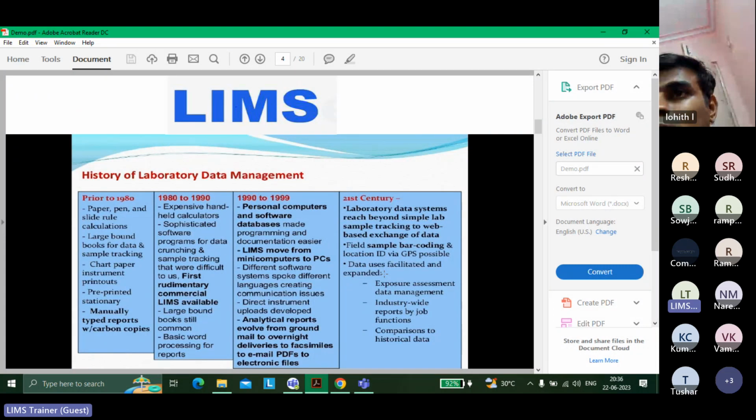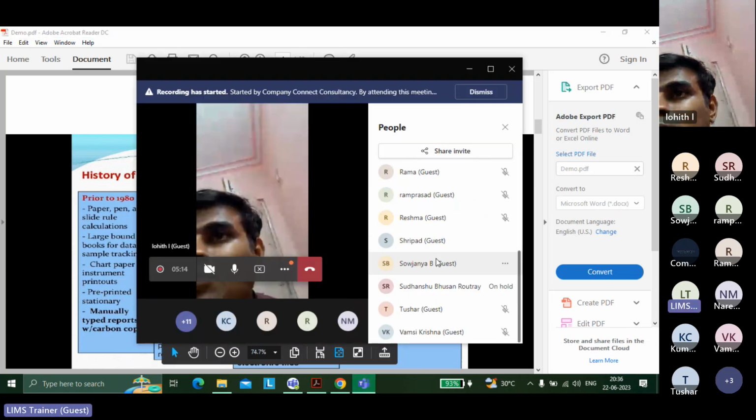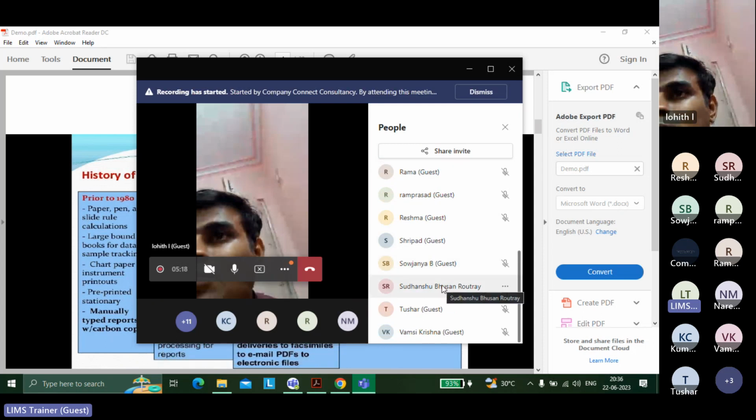So basically, if anyone asks you what a laboratory information management system is, many people will answer in many ways, but basically you will say that it is a tool used to log samples, enter results, and report the results of those samples. Got it? Again, anyone can come back and say maybe they can put it in a better way, but I am telling you, define LIMS in one sentence. That's the toughest thing, right?